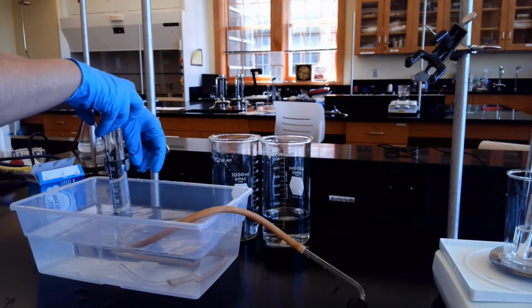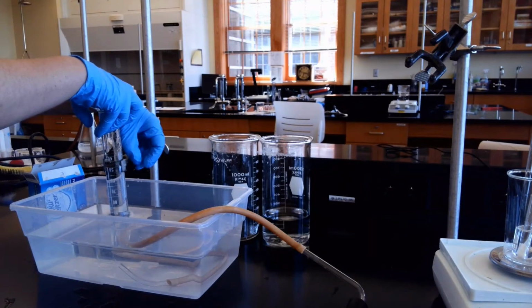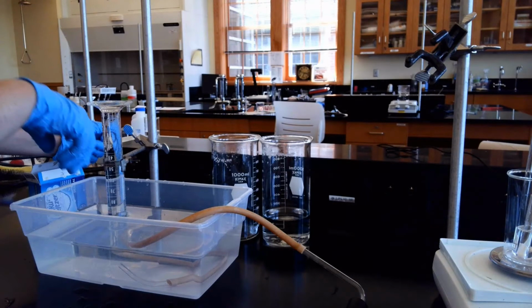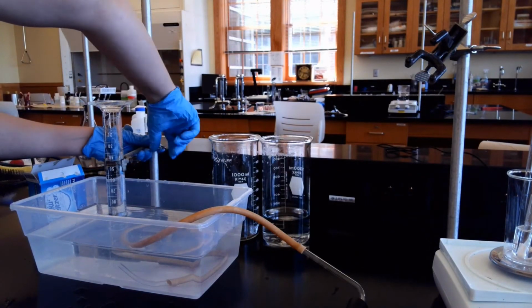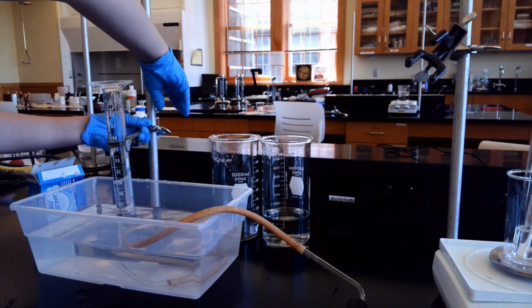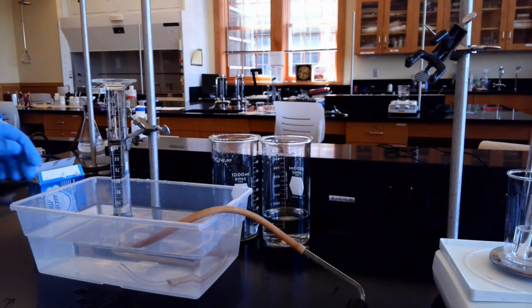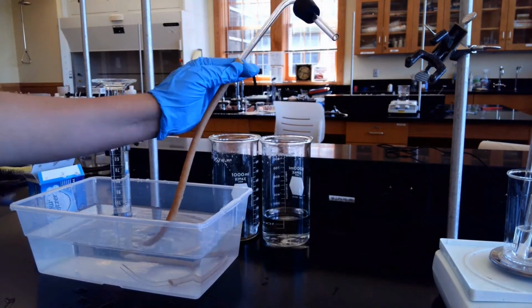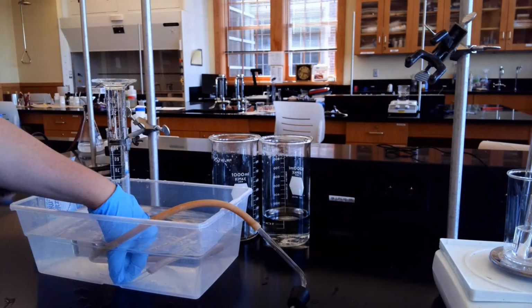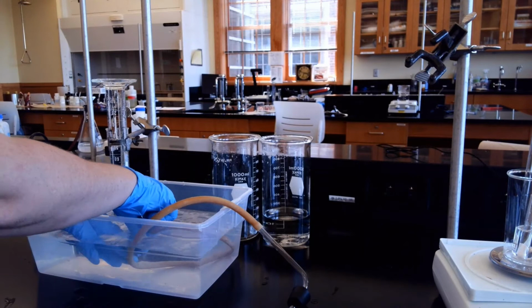Open up our clamp just a little bit and tighten it on. So now we're clamped into place. The next thing we're going to do is raise this clamp up. As long as we don't break the seal, we should be all set. So this is going to hook into the top of our gas generator, and this little piece of glass down in here is going to go underneath.